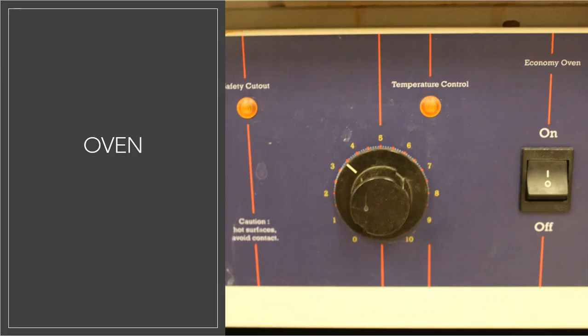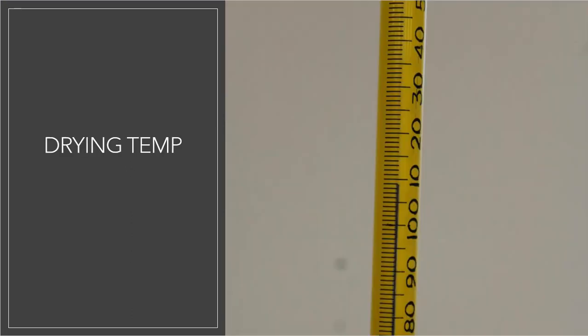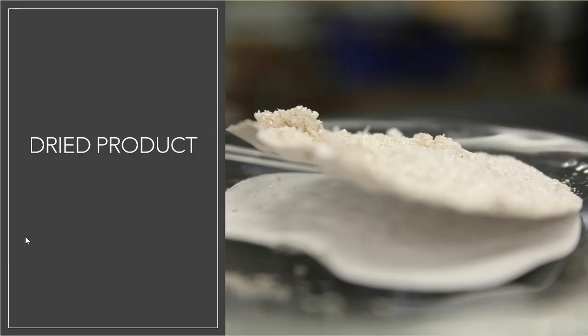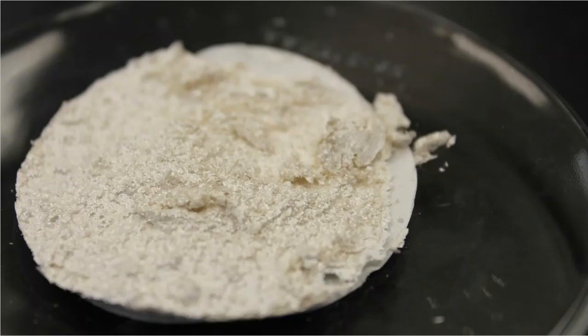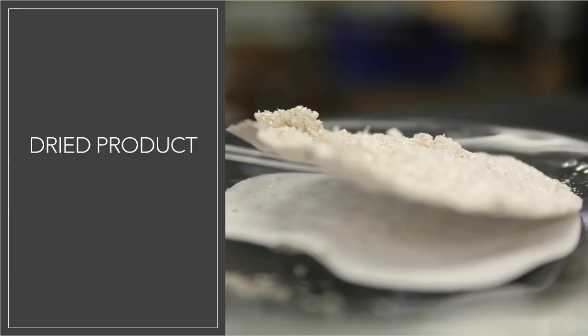So I take that product and I go back to the oven. There's my oven setting. Here's my oven temperature. Again, I'm okay with over 100 because I know what this is supposed to be. And that dried from 1:54 to 2:40 p.m. Almost an hour. When I took that product out of the oven, this is what it looked like. And once again, it comes to me in one big chunk, just like the crude product did.